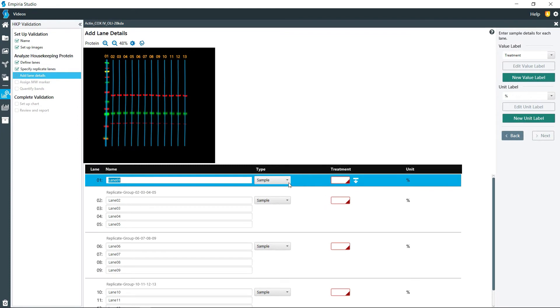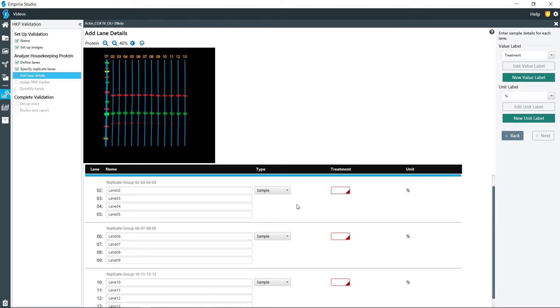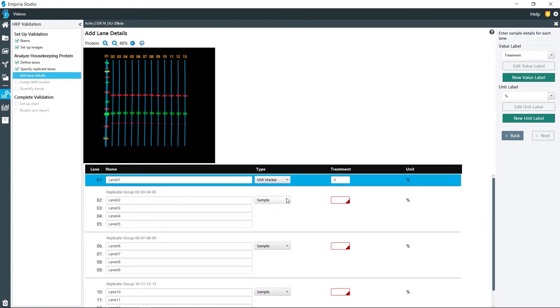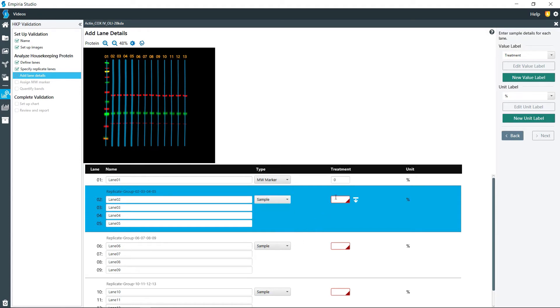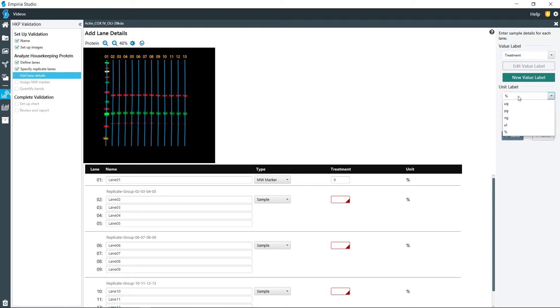So in lane one right here we have the molecular weight marker. Then the rest of these are all samples. But if you have a lane, you can designate it as your positive or negative sample, and you can also add treatments, amount, concentration, or dose.